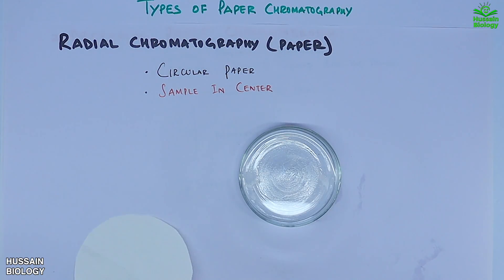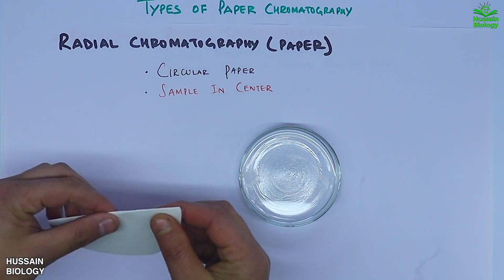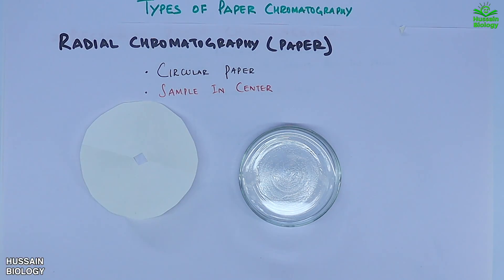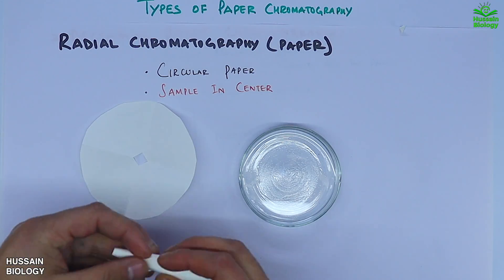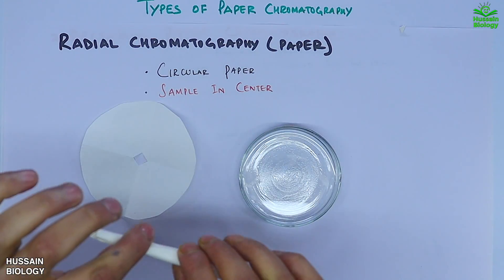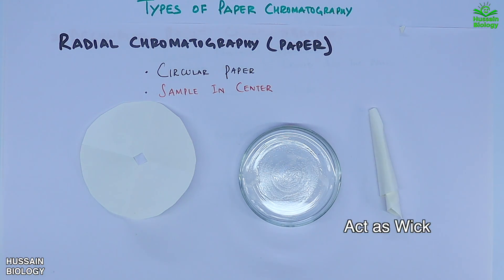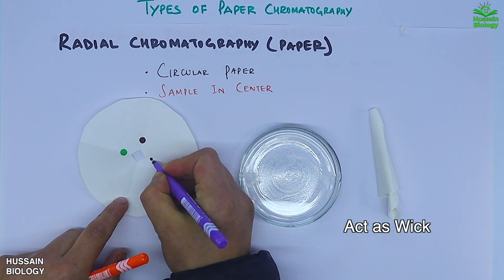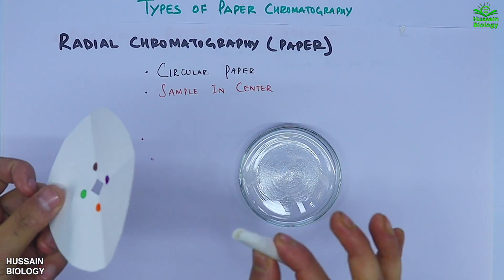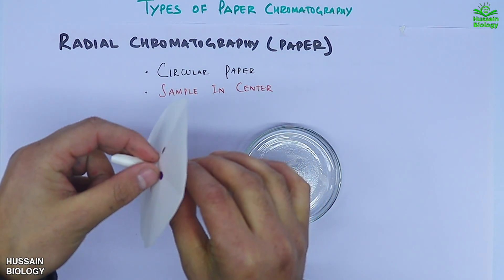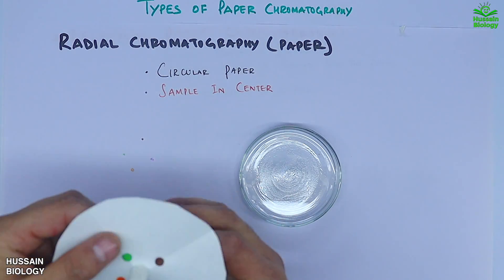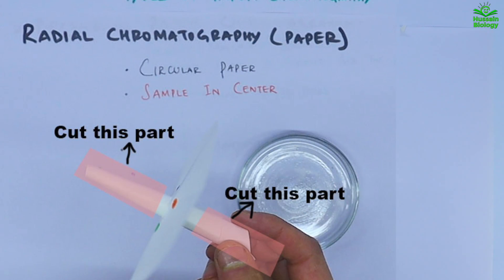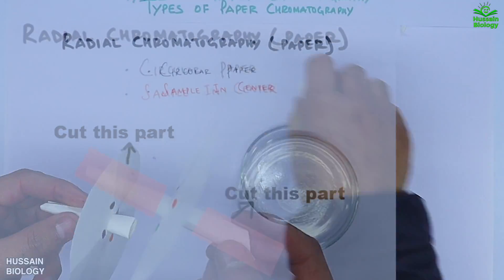We take a circular filter paper and a petri dish with methanol. We fold the circular filter paper and make a cut in the center to get a hole. Then we roll a piece of paper into a cylindrical shape to act as a wick. We put ink samples around the hole in the center, fit the cylindrical paper into the hole, cut the extra length above the circular paper, and leave half an inch of cylindrical paper below — which will be dipped into the petri dish.